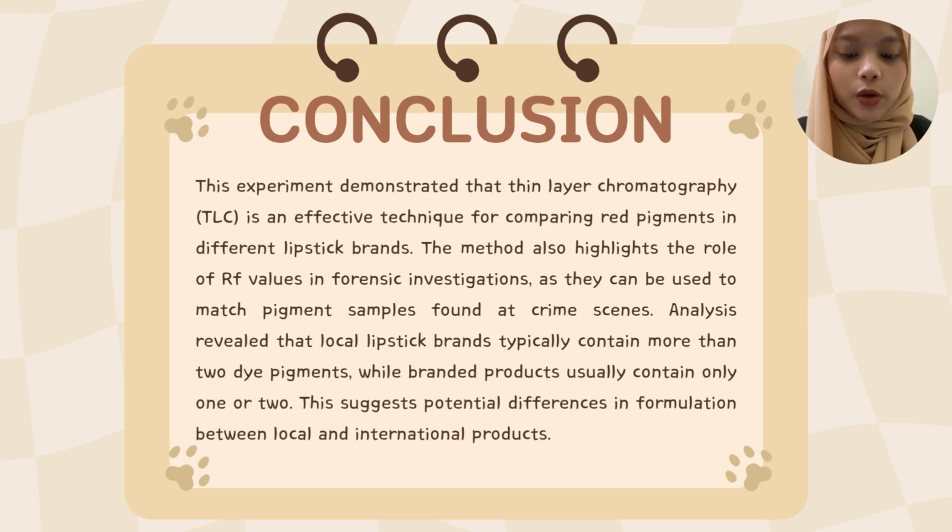Analysis revealed that local lipstick brands typically contain more than 2 dye pigments, while branded products usually contain only 1 or 2. This suggests potential differences in formulation between local and international products.